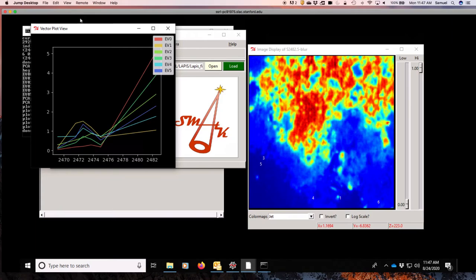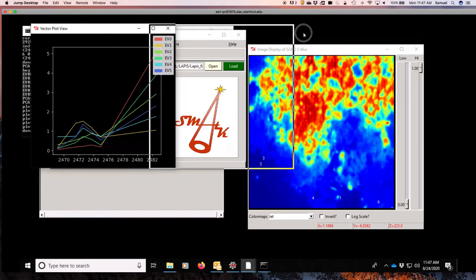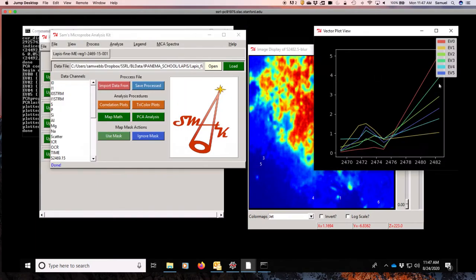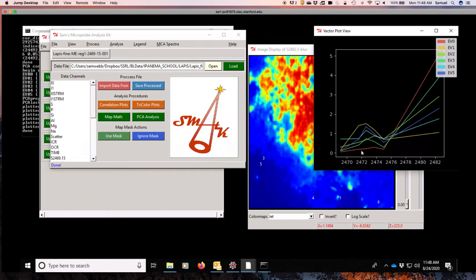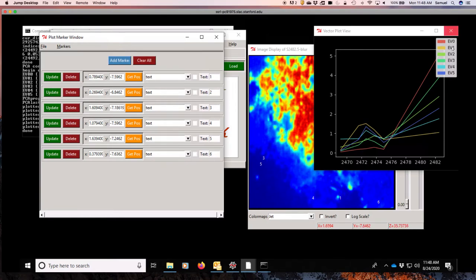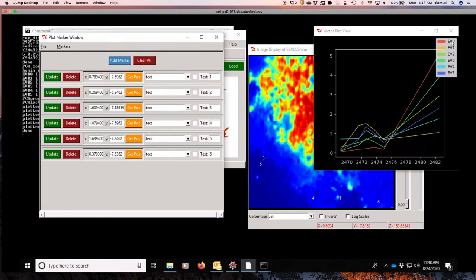Whenever we do any of these PCA-type methods, it always pops up a box with the actual component vectors there. If you notice, compared to maybe a PCA method, that these actually look like real spectra, and that's because they actually are real spectra. They are actually coming from the specimen itself. Because these come from real spectra, we also have now automatically populated the plot marker window with the location of these spectra. Unfortunately, here it's labeled 0 through 5, and it's 1 through 6 here. So, that very first eigenvector 0 is this one here, which is located right there.